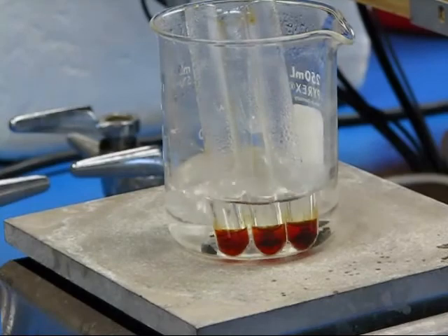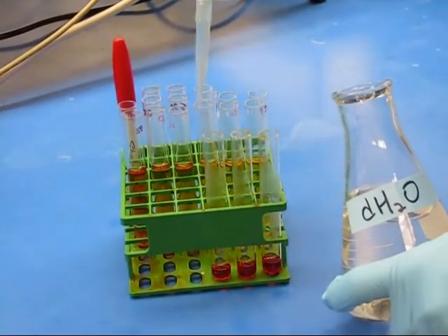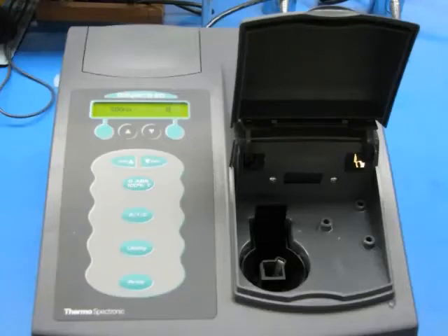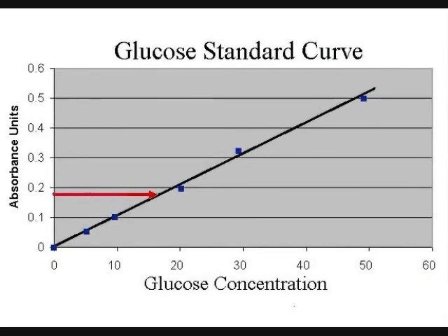When the tubes are cool, add another five milliliters of distilled water to each. Measure absorbance in the spectrophotometer and use your standard curve to extrapolate the concentration of glucose in each sample.